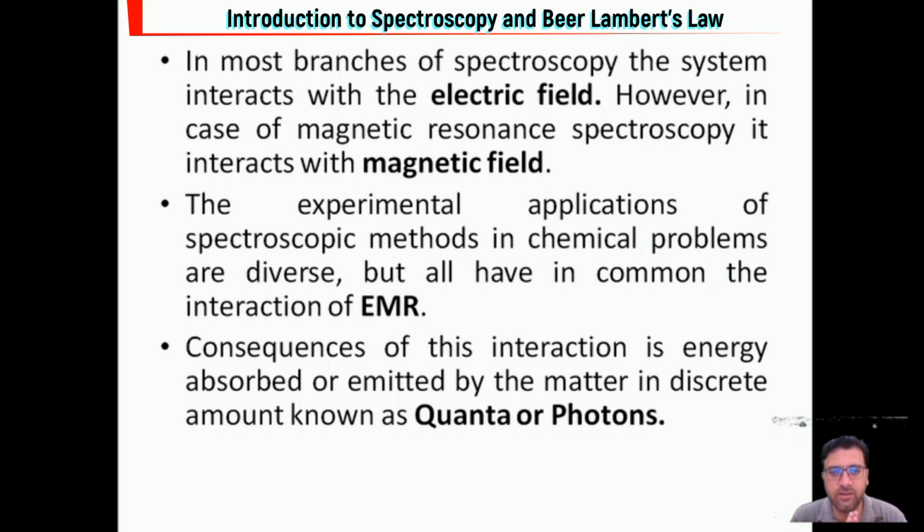The experimental applications of spectroscopic methods in chemical problems are diverse, but all have in common the interaction of electromagnetic radiations. As a result of this interaction, energy is absorbed or emitted by the matter in the form of quanta or photons.